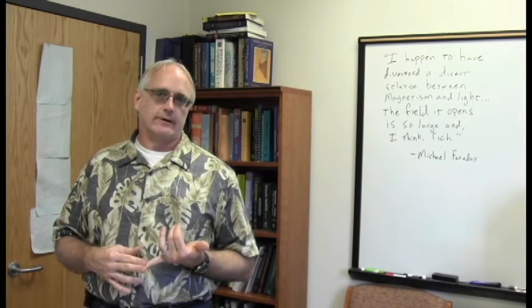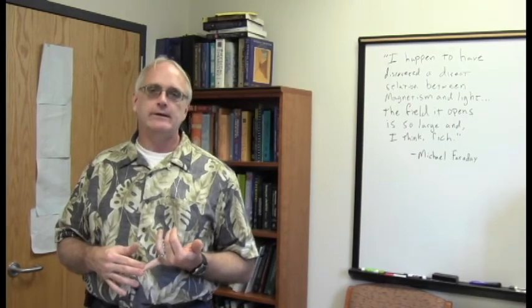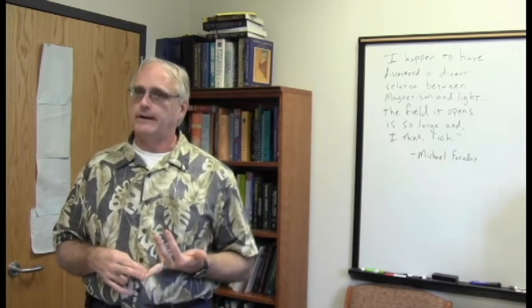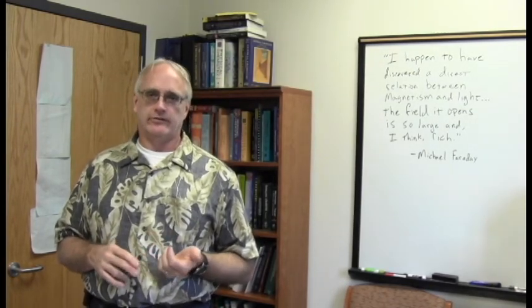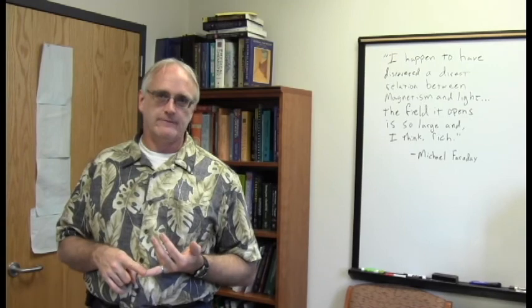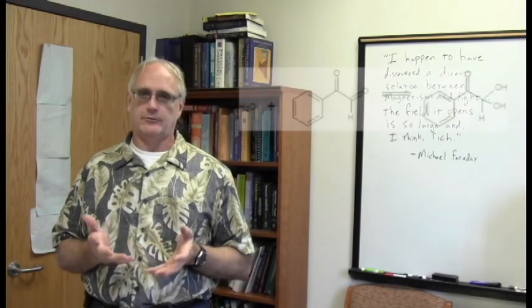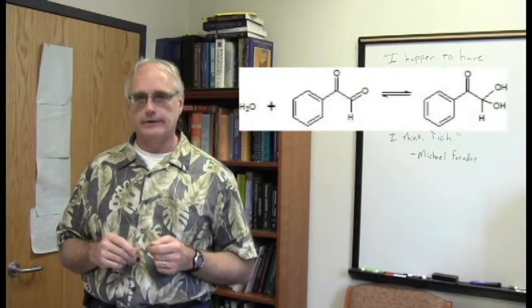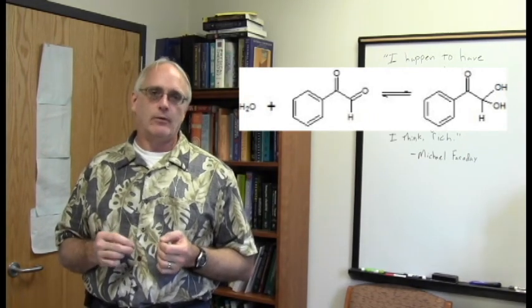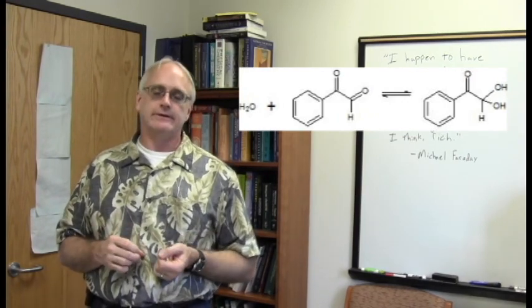We used our knowledge of chemical shifts to make predictions and to try to understand the spectra we actually did see. We used our knowledge of chemical structure and number of groups and how symmetry, especially in that aromatic ring, can play a role here. We used some of our fancy techniques, the D2O drop test and DEPT 90 and DEPT 135 spectra, and all of that came together to produce this proposed reaction going on with phenylglyoxal and water that is beautifully consistent with the spectra. And it's just a nice illustration of the power of NMR spectroscopy to investigate and answer routine research questions.